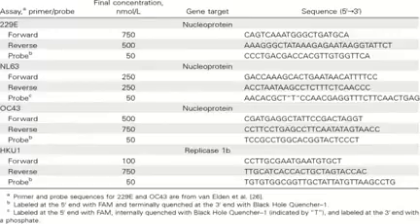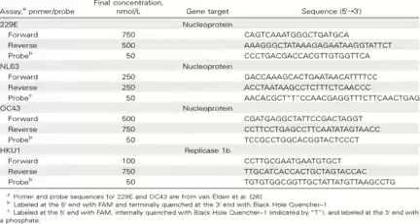This is the RT-PCR panel primer and probe sequences.